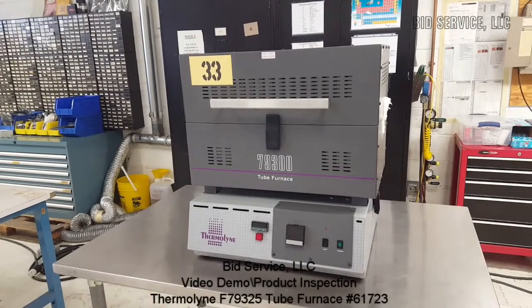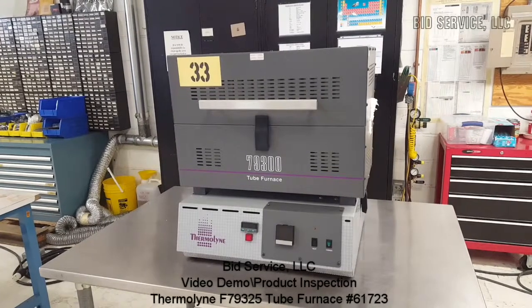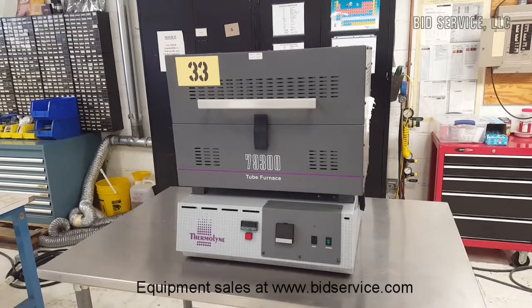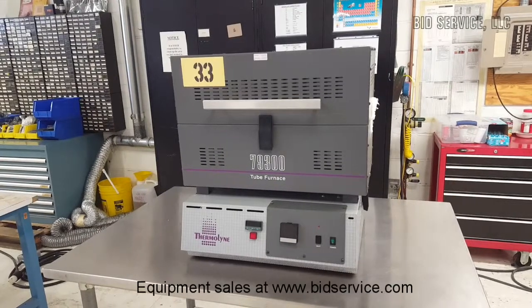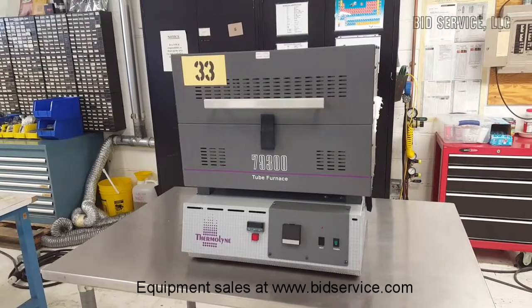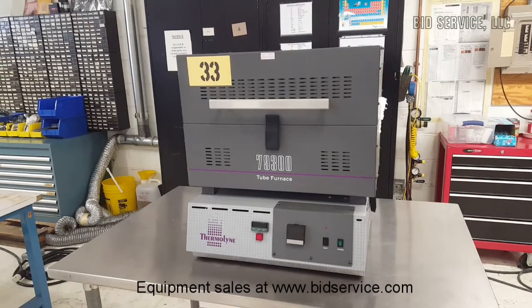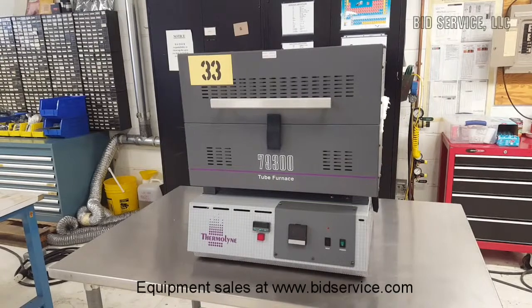This is a demonstration of Thermaline's F79325 tube furnace. This is a 1200 degree C split tube furnace with a digital single set point controller. It has an operating temperature of between 100 to 1200 degrees C, inside dimensions of 4 inches in diameter by 12 inches long, and is powered by 120 volts AC requiring 24 amp service.